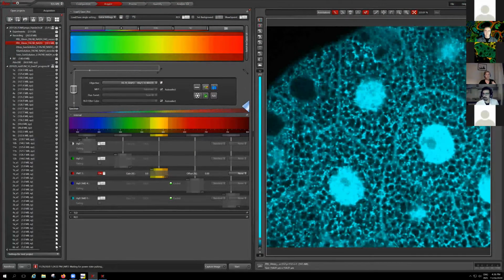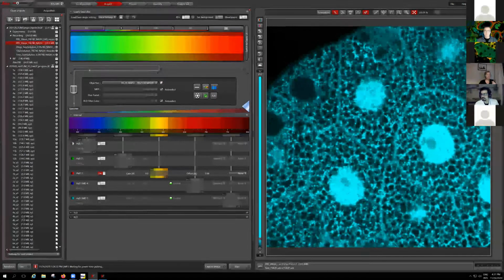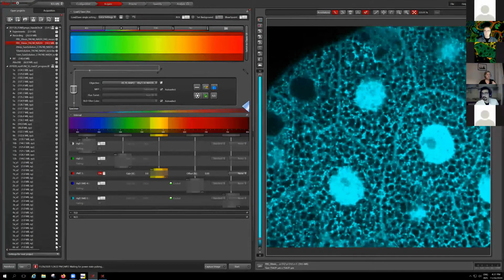Okay, Hela is saying that's why we prepare the salivary glands. Can we measure in vivo as well? The larva is not that transparent as far as we know. So it's just a matter of transparency and how we can image that in a light microscope. Otherwise, if the sample would be transparent, yes, we prefer to do that in vivo, but not with this sample.